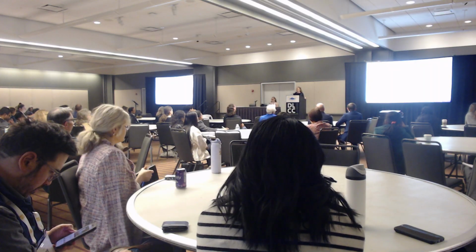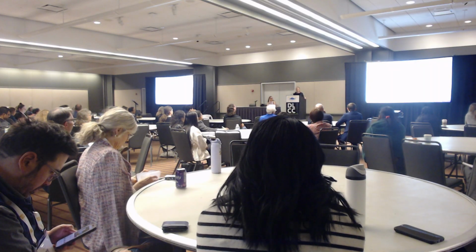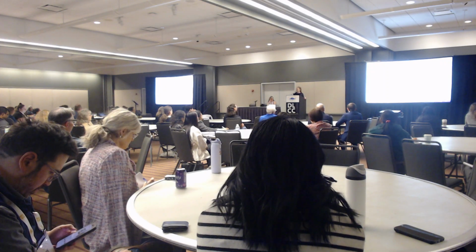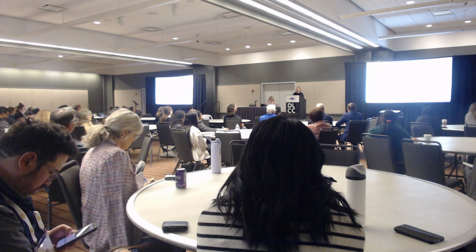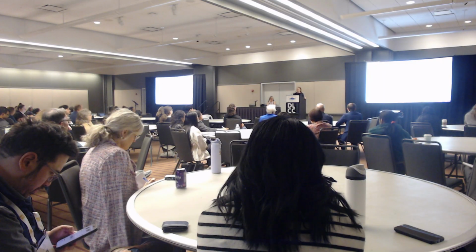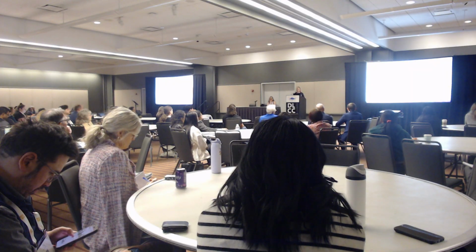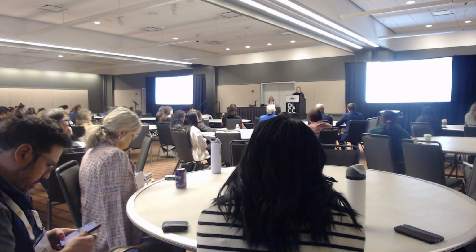And I think very importantly, you're not losing resolution on those shorter library peaks that are so important for applications like fragmentomics. This really is enabling in that you can layer in that methylation information in addition to standard fragmentomics profiling. Bisulfite, by comparison, loses resolution of all of those shorter peaks. It also just generally loses information and loses coverage of this sample because it is so damaging in nature.